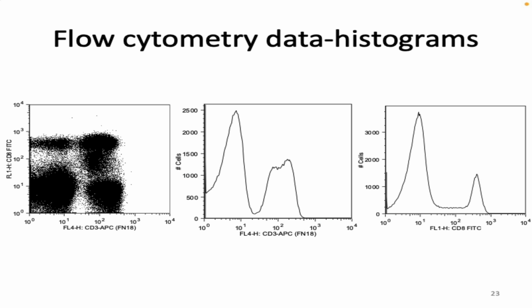So they showed you in the video how this can go sideways. They showed you histograms going sideways and matching up with the dot plot. And I can't do that. But if you need to see it again, these slides are posted, and you can watch the video.